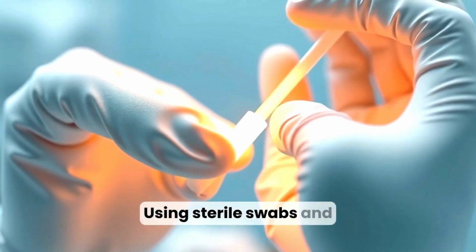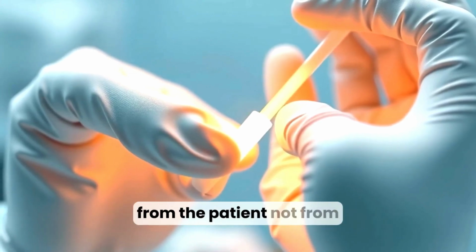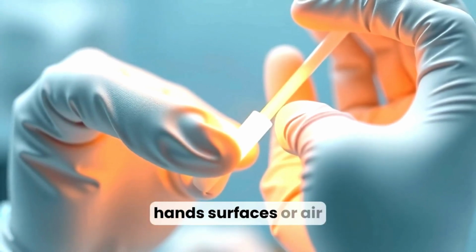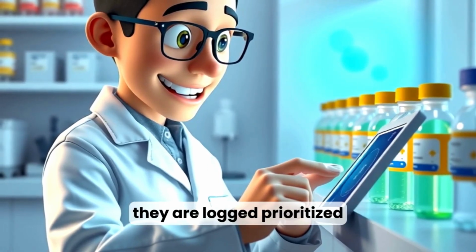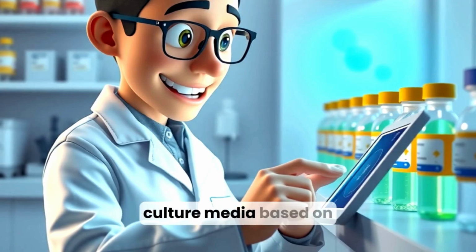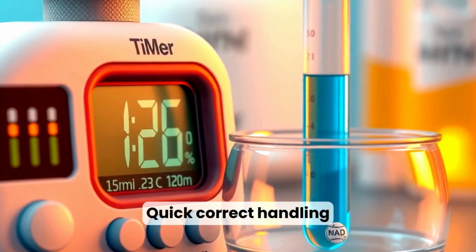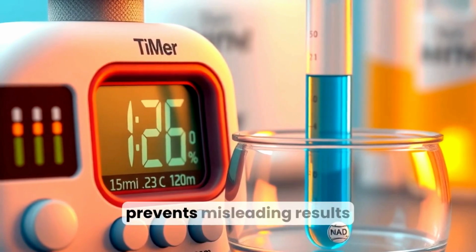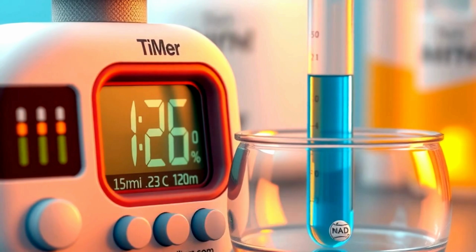Using sterile swabs and avoiding contamination ensure that organisms recovered come from the patient, not from hands, surfaces, or air. When samples arrive in the lab, they are logged, prioritized, and matched to appropriate culture media based on suspected organisms. Quick, correct handling preserves viability and prevents misleading results, which keeps patient care timely and accurate.